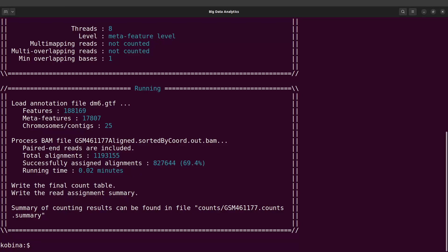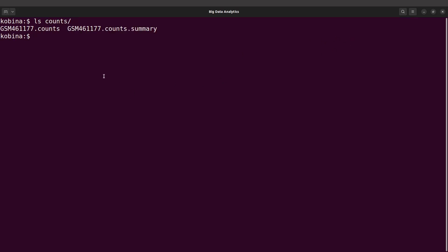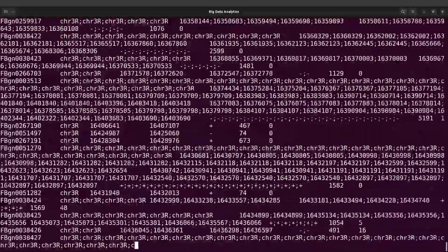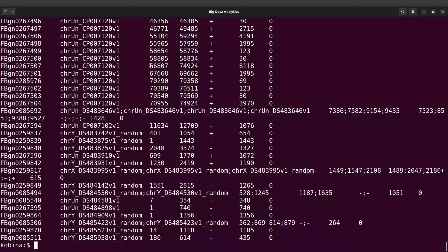We will clear the screen and continue. When we do an ls into the counts directory, we are going to find the output files for this sample. We can do a cut into the counts file — counts/GSM461177.counts — and it gives you lots of information including the counts.